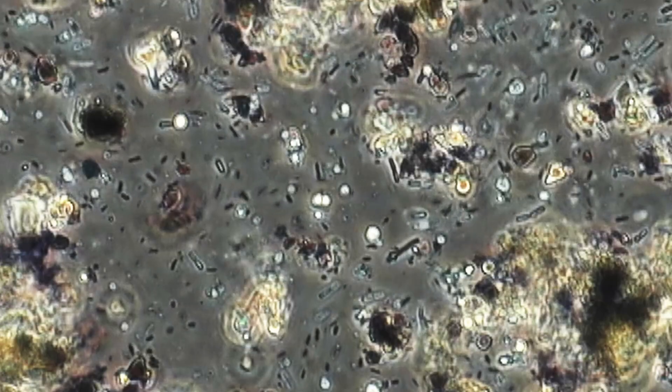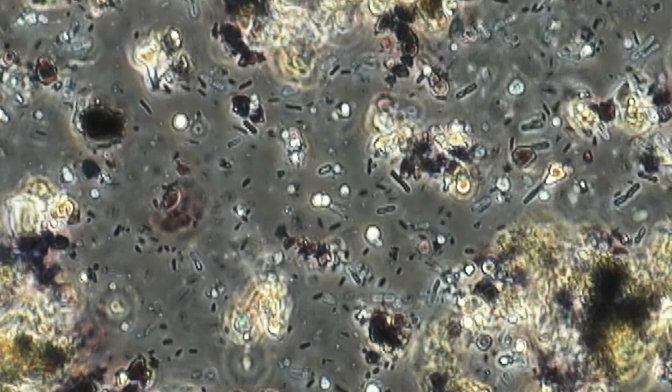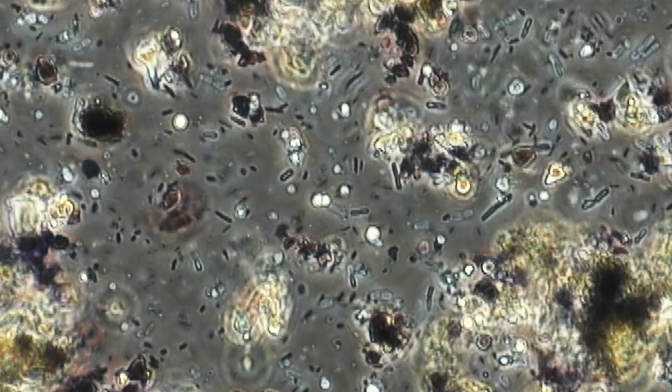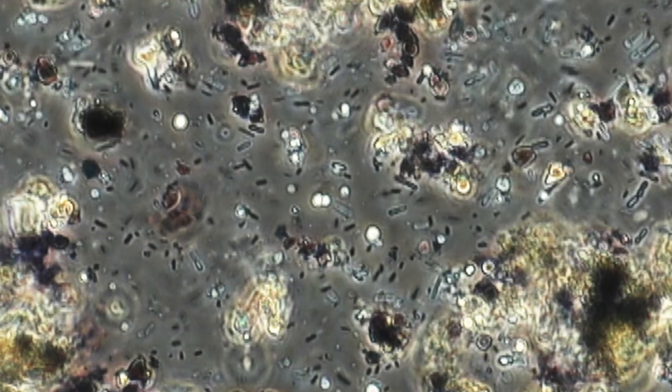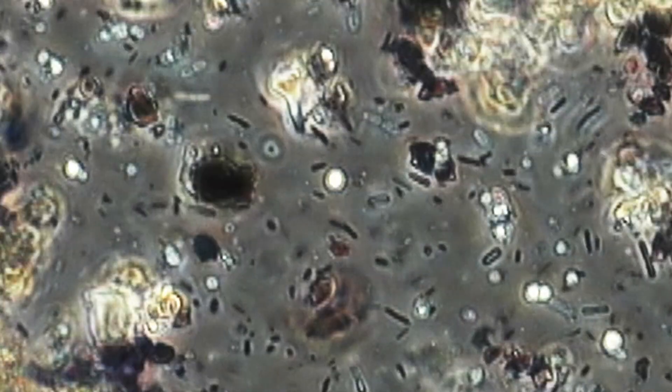But I saw something different as well. I actually saw a lot of bacteria present. Those bacteria have a really regular shape. They were quite significantly smaller than some of the starch grains. Many of them had this typical rod-shaped appearance. Some even were present in pairs. Very typical for bacteria, especially on phase contrast microscopy. They were quite well visible and present in an extremely large amount.